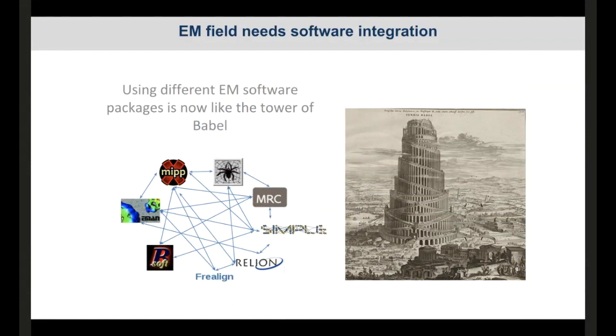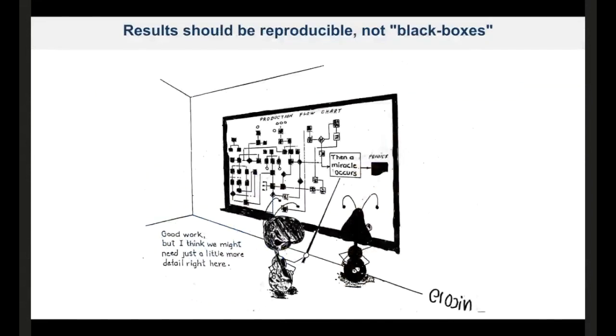But at the same time, it's quite messy and difficult for a user to combine different programs in a whole project and convert data from one format to another, with different conventions of rotation. All this, I think, is unnecessary, and it's a big problem that we can try to solve and allow more time for analyzing the data and focusing on the scientific problem.